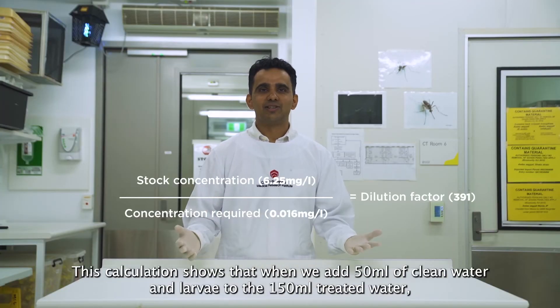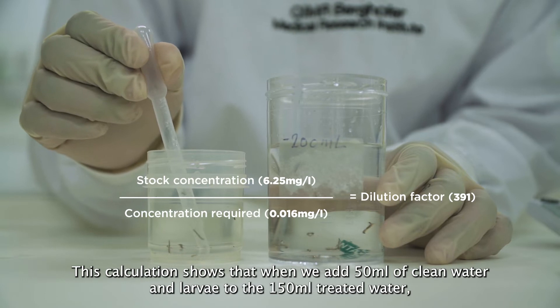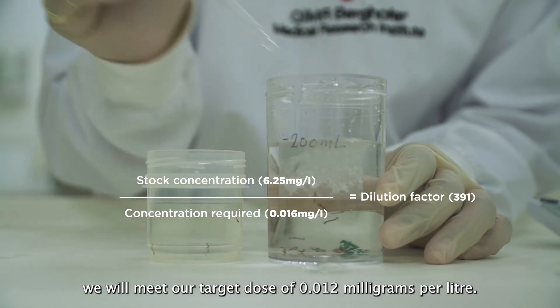This calculation shows that when we add 50 ml of clean water and larvae to 150 ml of treated water, we will meet our target dose of 0.012 mg per litre.